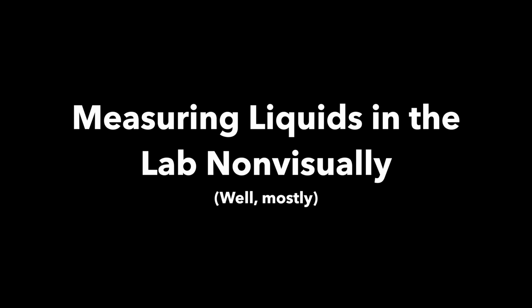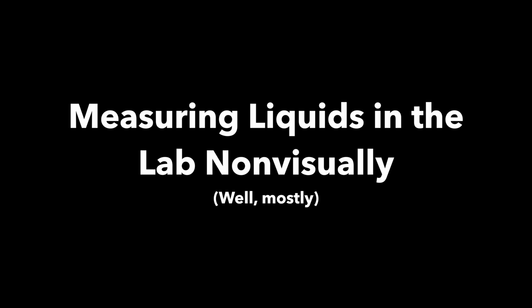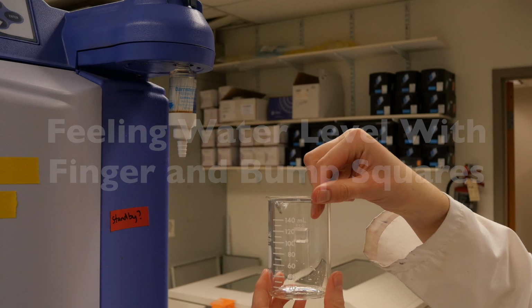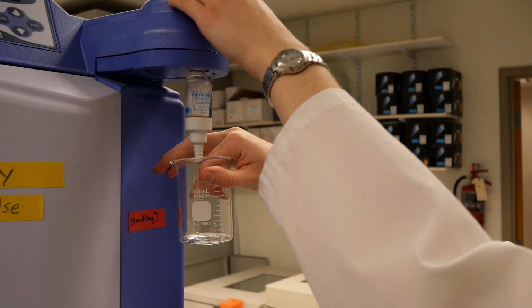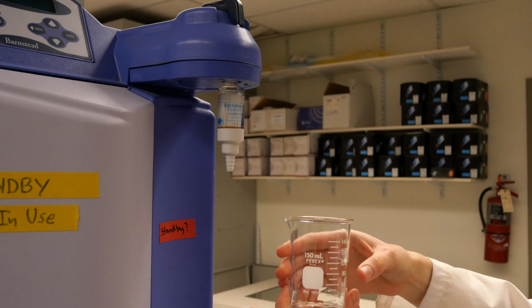Measuring liquids in the lab non-visually. Well, mostly. Feeling water level with finger and bump squares. Caroline has a 150 milliliter beaker and she put a bump square inside the beaker.